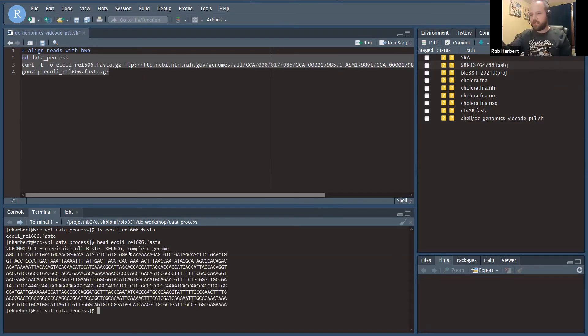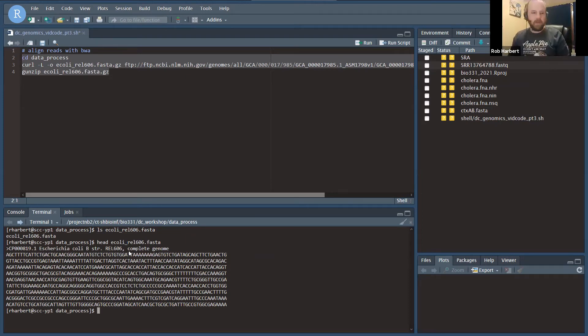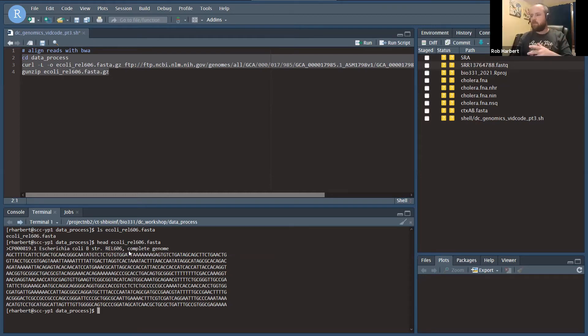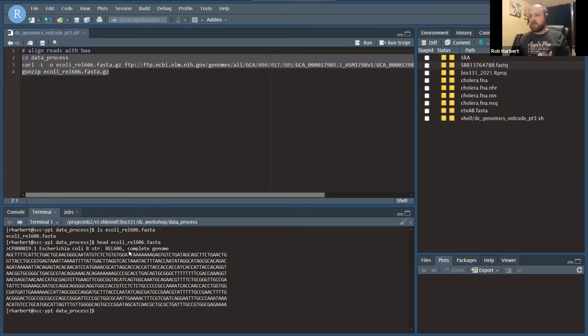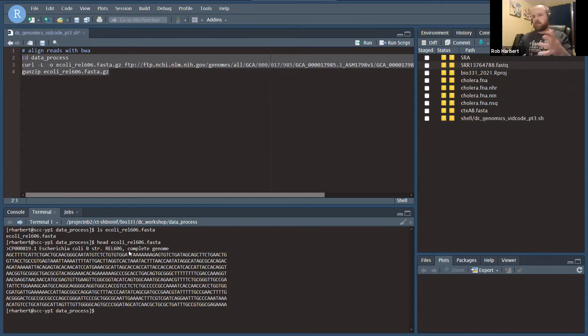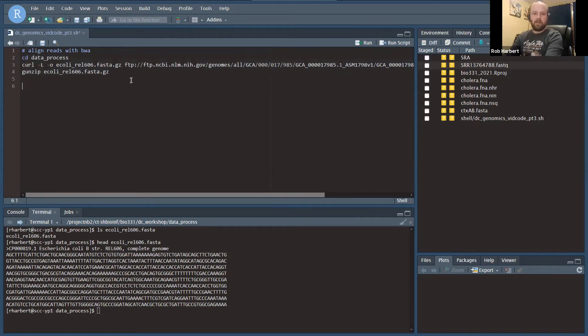We have some sequence data: E. coli B strain REL 606 complete genome. That's our reference data. What we want to know now is how do our reads align to this reference genome? We have 1.5 million sequence reads, the genome is 4.6 million base pairs long. Where do all these reads go? That's our next question.